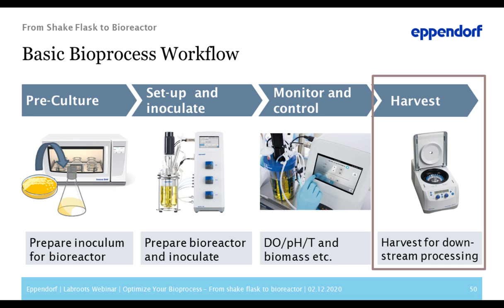So no matter what process is chosen, in the end stands the harvesting. And the separation of a protein of interest from a reactor is the first step in a downstream process. The selected harvesting method must be carefully chosen and would give enough food for another webinar. So shortly, it depends on the type of cells, product, and properties of the process fluids. Traditional techniques include, for instance, centrifugation and diverse filtration techniques, disc stack filtration, tangential flow, and so on.